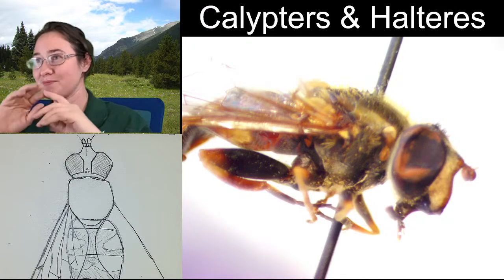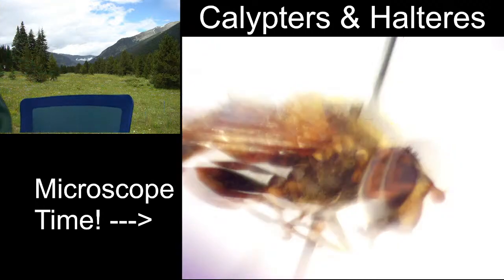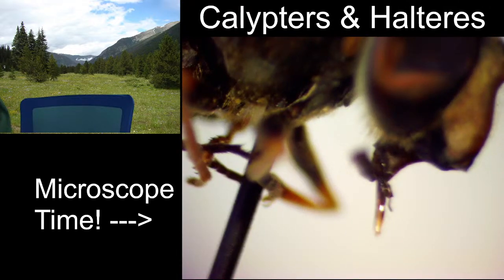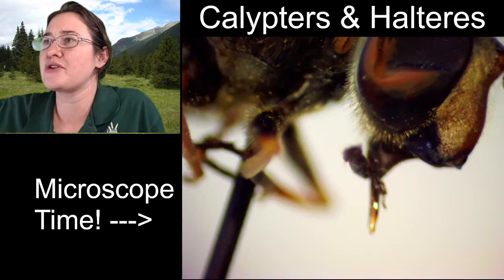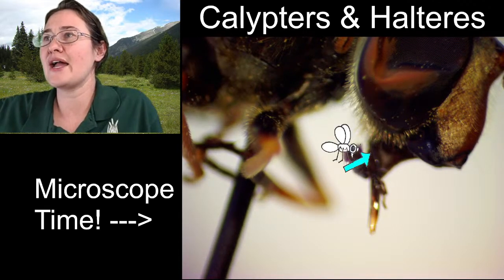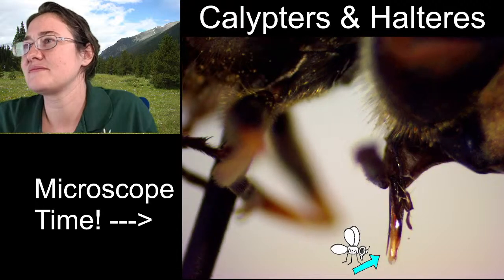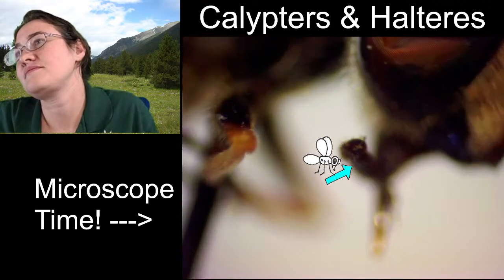He's got a funny face shape. Okay. He's got a sheath that protects his mouth, and his mouth is going to be used to drink nectar. So you can see that the sheath is kind of pulled up right now. It's right here. There's this little sheath that's kind of pulled up, and this pointy thing, that's the way that this fly is going to drink nectar. And this back here is the sheath that protects it.